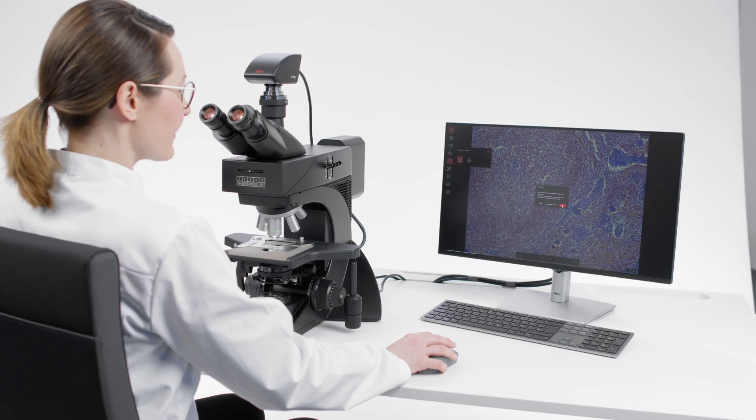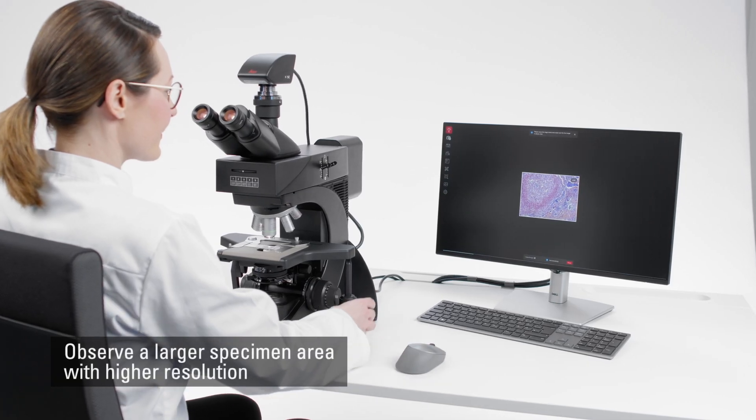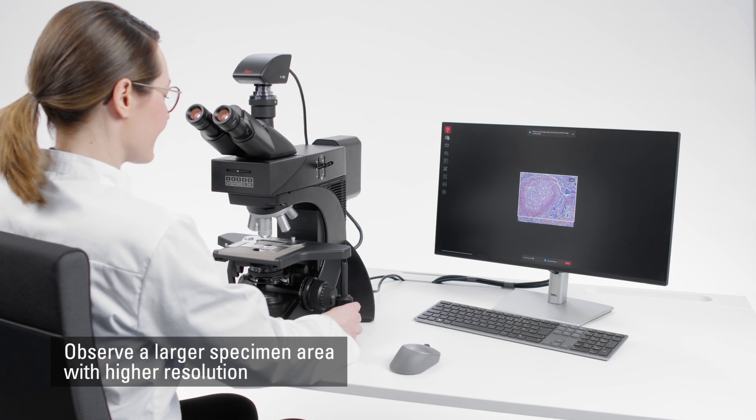You can observe a larger area of your specimen with higher resolution using the x-y stitching function.